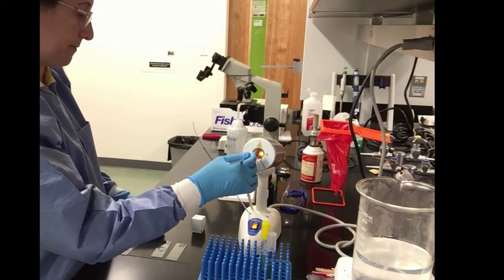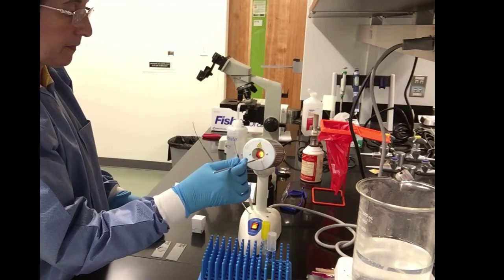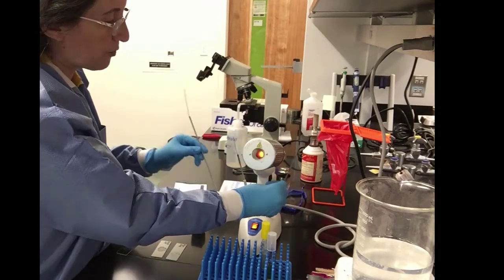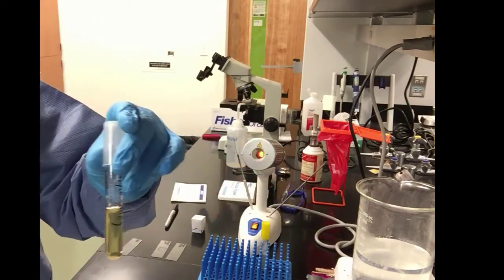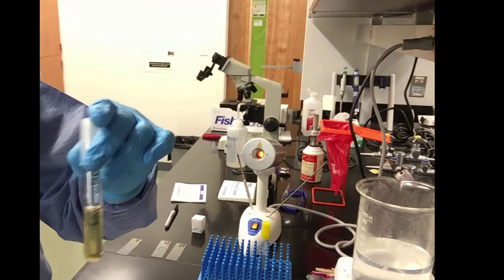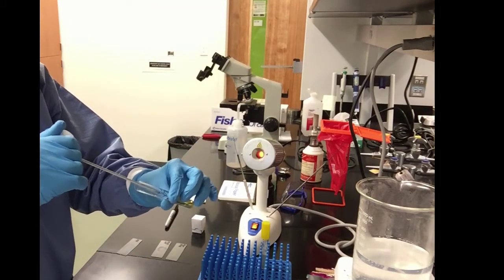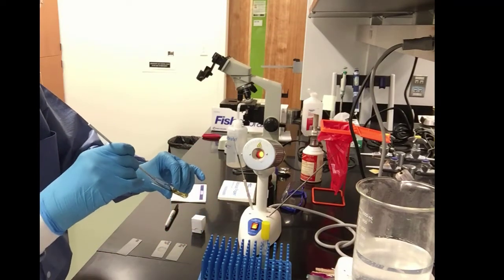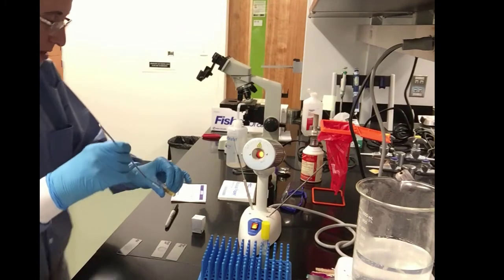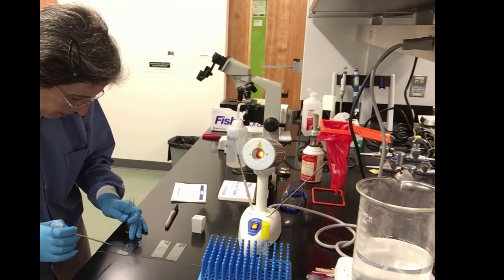Sterilize our loop. We are almost done with the smears stage. We will now pick up another loop that's cooler. So we will pick up our Mycobacterium smegmatis and we will take a sample again from the bottom and we will go ahead and smear into the drop of water and the staph that we've added and make our mix.